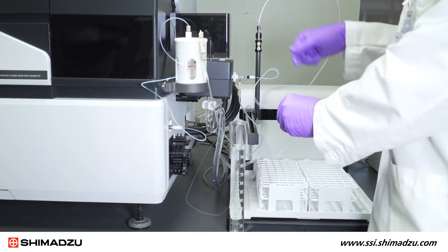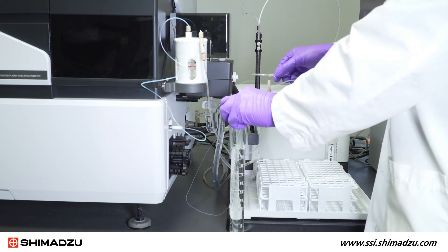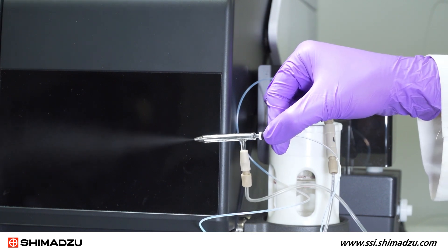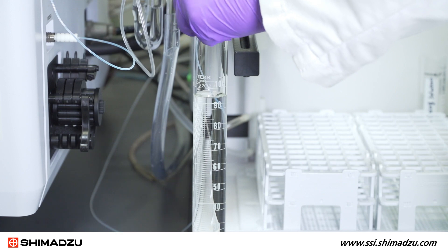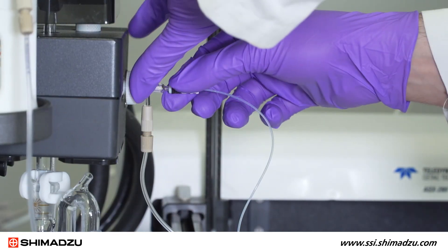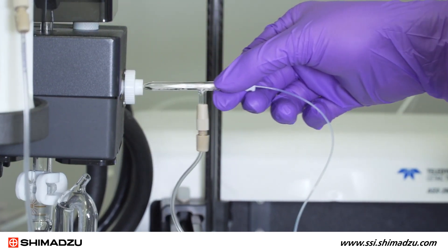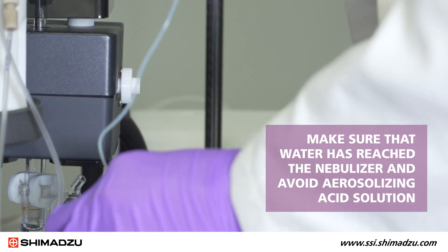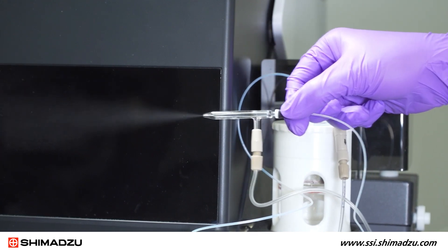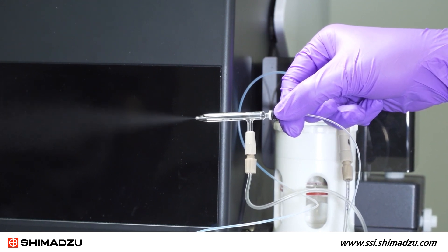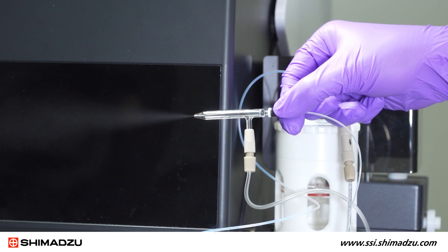The orifice of the nebulizer is very small, so even minute particles can block it partially or even completely. To check the uptake consistency and aerosol from the nebulizer, first make sure the plasma is off. Then put the sample tubing in deionized water and use the instrument control window to turn on the carrier gas to 0.7 liters per minute. Remove the nebulizer from the spray chamber, but keep it connected to the sample and carrier gas tubing while aspirating a water solution. Make sure that water has reached the nebulizer and avoid aerosolizing acid solution. Check to see if you get a constant spray without any spitting. The shape of the spray should be a symmetrical V-shape, centered at the tip of the nebulizer and consisting exclusively of very fine droplets, like a mist.